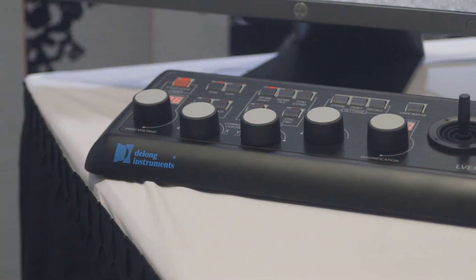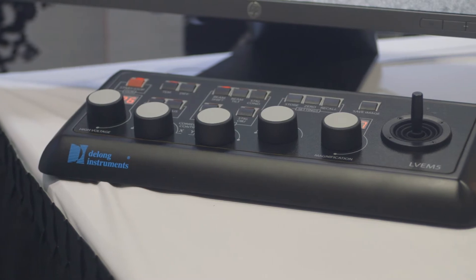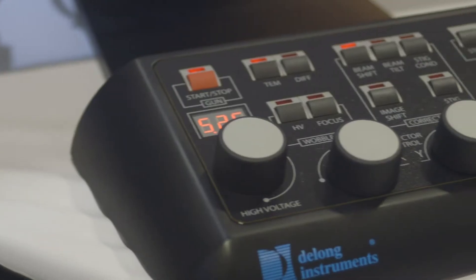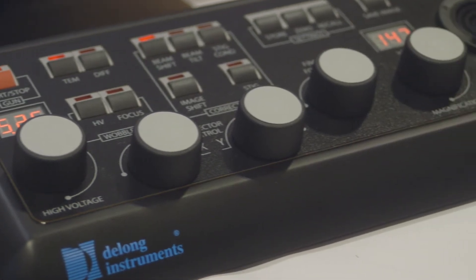The LVEM5 is operated through a simplified control panel. All image data is saved in sequential non-proprietary formats for further analysis in the operator's software of choice.